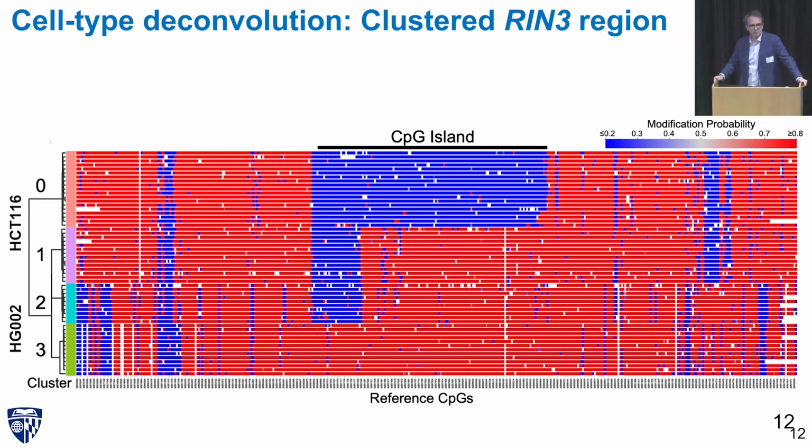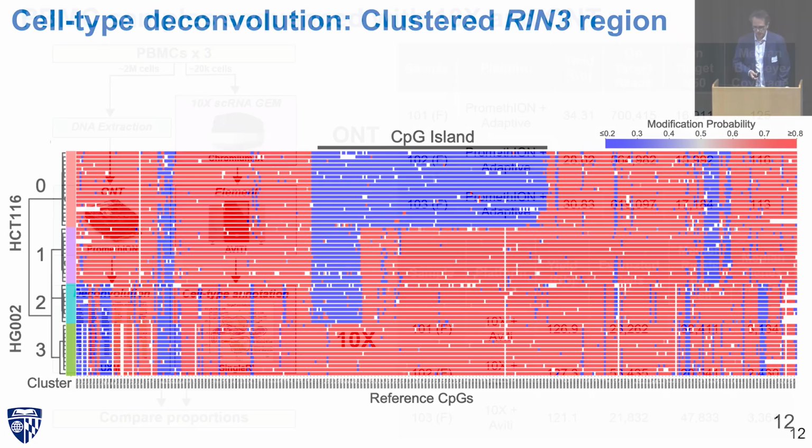We're not the first people to think so. Even back in the microarray data era, Houseman et al. and others have used methylation signals to be able to figure out from, say, whole blood, what the distribution of cell types are. Because different cells in your body have different epigenetic signatures. And folks like Joe Ecker and Tommy Kaplan have generated these big methylation atlases, which are really useful to people like me who are very lazy, to be able to just look up and see, oh, what does that cell type's methylation profile look like? And then be able to use that to look at my reads.